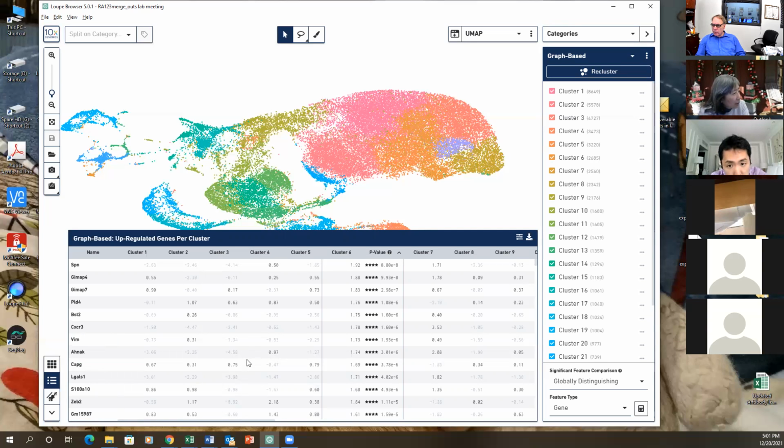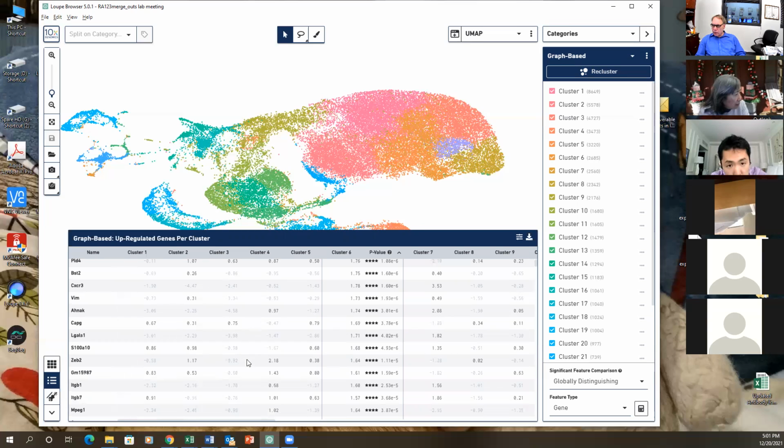I wonder why there are so many precursors or whatever they might be. What precursor? Oh, you mean this? Yeah, why are those other ones tied into that? And there's a funny one that shows up out of nowhere. Maybe that's the precursor because it's just north of it and it's smaller.